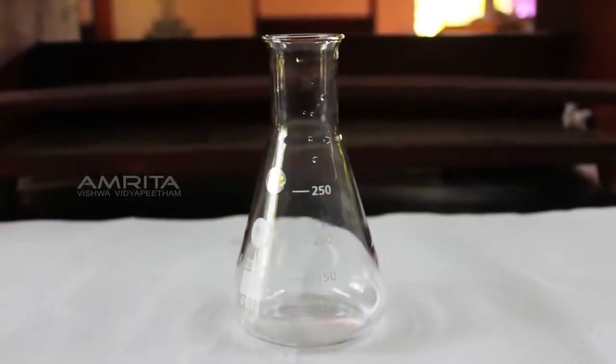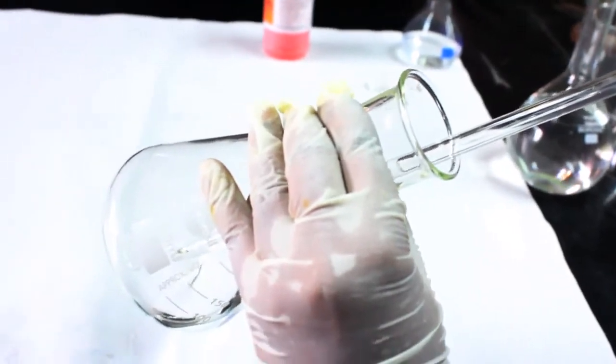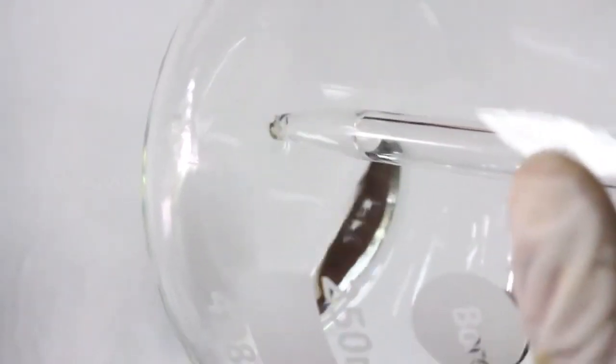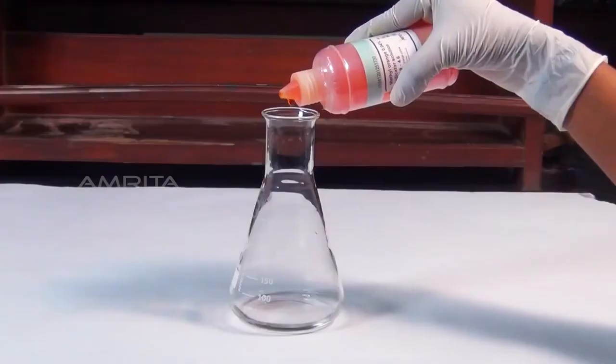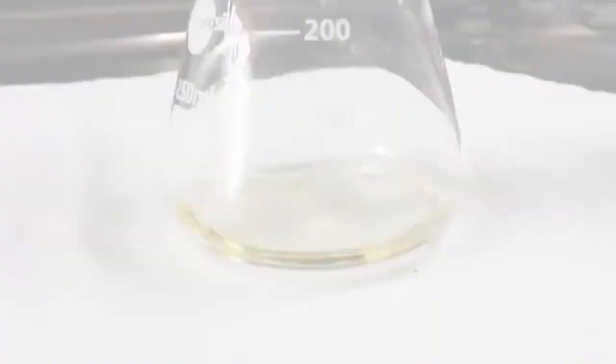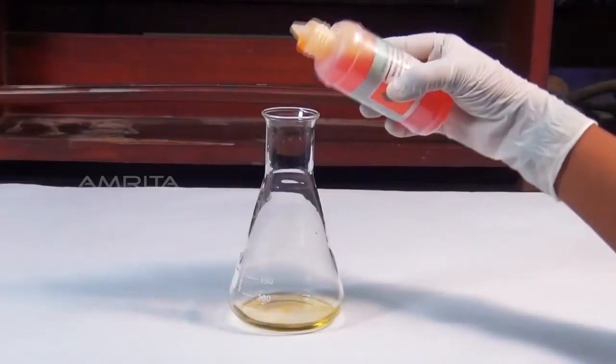Take a clean conical flask and carefully transfer the 20 ml sodium carbonate solution into the conical flask. Then touch the tip of the pipette with the bottom of the conical flask to transfer the remaining solution from the pipette. Then, add 2 drops of methyl orange indicator into the conical flask so that the color of the solution in the conical flask becomes yellow.